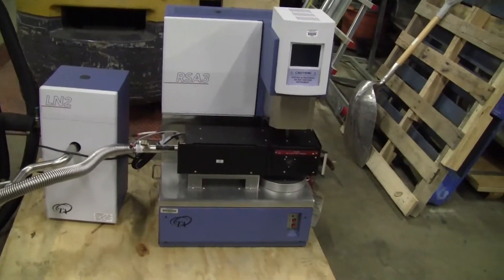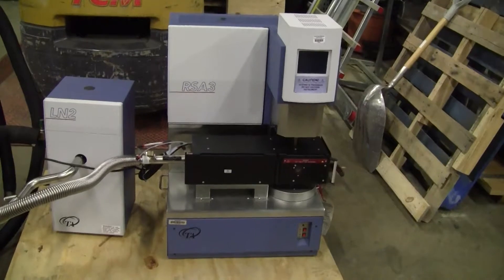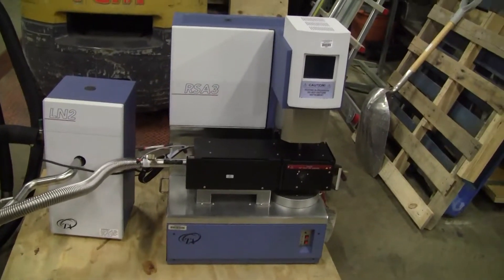Hi, this is Jim from HitechTrader. Today we're looking at a TA Instruments RSA-3 Dynamic Mechanical Analyzer.